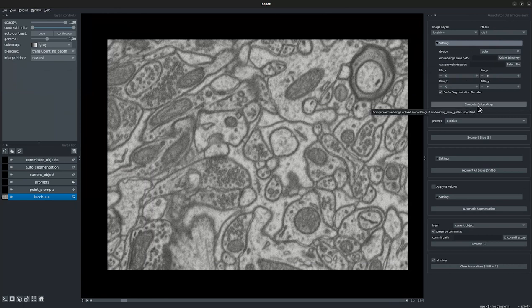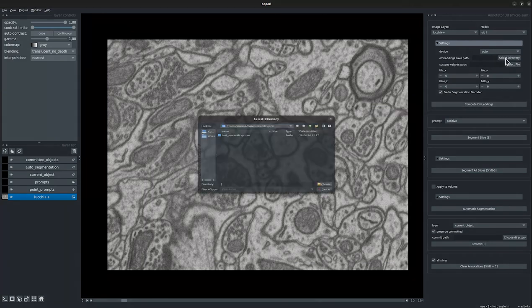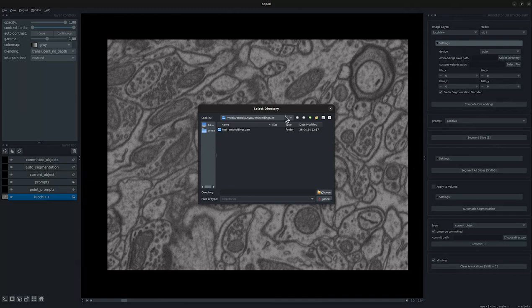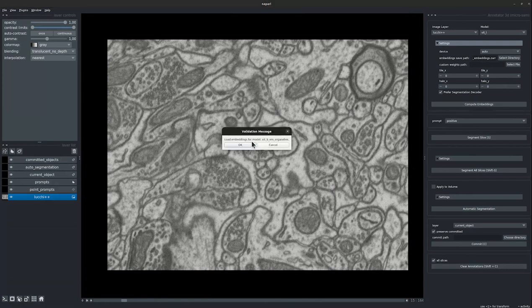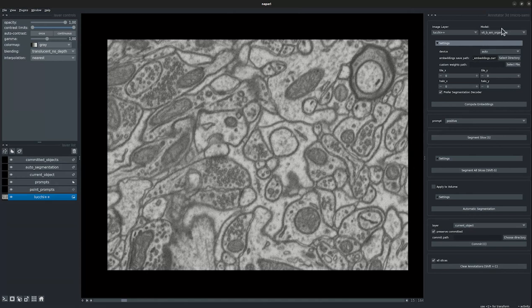This option allows you to compute the image embeddings. Let's go ahead and load the pre-computed image embeddings which we already have. Now let's click on compute embeddings to load them. MicroSAM automatically validates this option for us and updates the chosen model which was used for pre-computing the image embeddings. This has been loaded for the vitb-em organelles model.